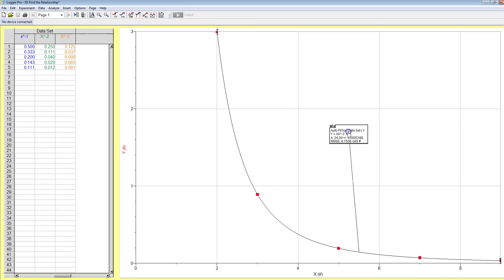So we just did the same thing we did before, only using a different tool. Same thing: I'm going to print this out, and you should be able to do that for all 3 data sets. Hopefully that was helpful.